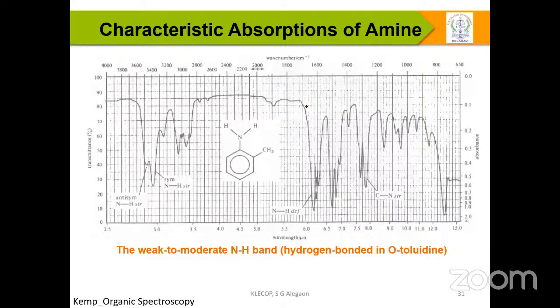Along with that, I'm going to get the NH deformation, or bending. This bending can cause confusion when you get to the amide. I'll tell you when the amide comes. Just remember the amide NH deformation, which I'm going to observe somewhere around 1662 and around 1550 or 1570. Can you see this region? Just remember this whenever we discuss amides, because it plays a very, very important role.